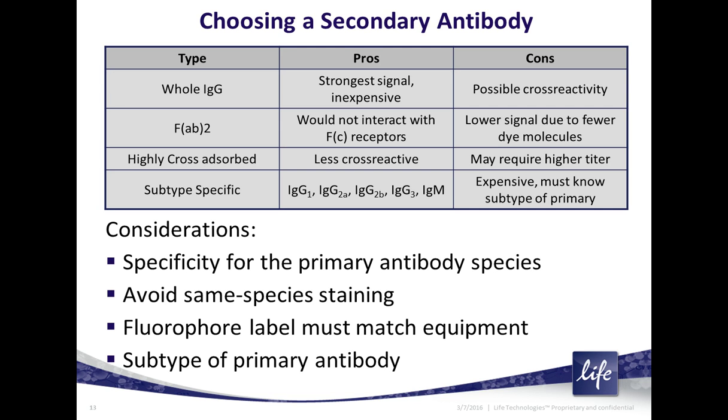And also you can have secondary antibodies against specific isotypes like IgG1 primaries or 2A or 2B. If you have two primary antibodies of the same species, like two mouse primaries, if you're in luck and you wanted to use them both on the same sample, one might be an IgG1, the other might be an IgG2A, and there are isotype-specific secondaries that target only one or the other, and thus you can use them together on the same sample. If they're both mouse IgG1, then your anti-mouse secondary would probably label both, and you don't want that.